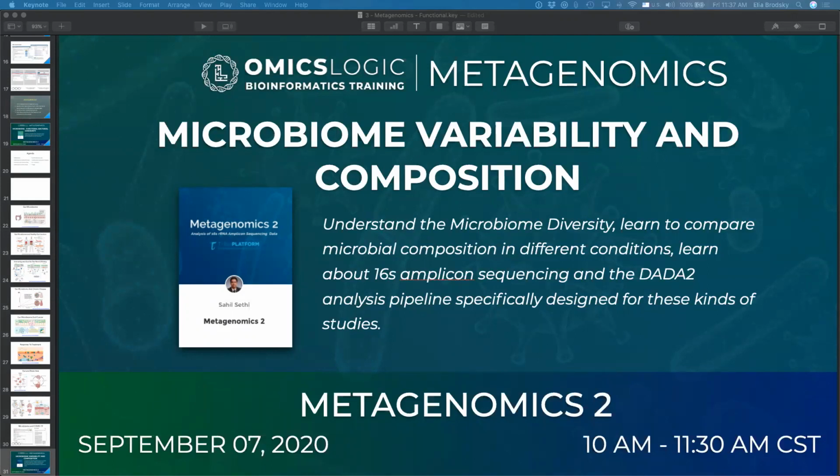Okay. So in terms of Python, obviously we will have a tutorial in R and Python next week after everybody has a chance to prepare a data set, right? That's the objective. So Mikhail, I'm actually going to put a lot of effort into making sure that we've got that ready, and we can look at the results and think of what to do in Python as well. Any other questions?